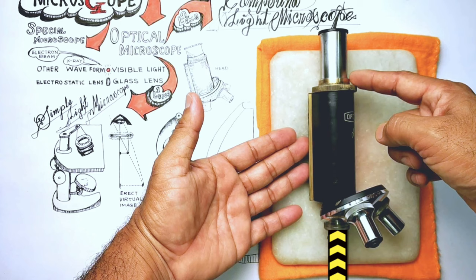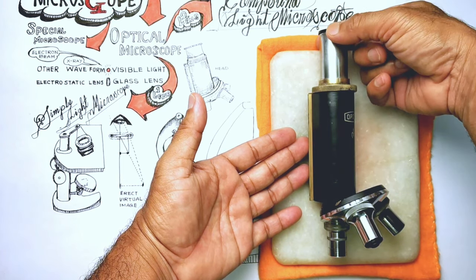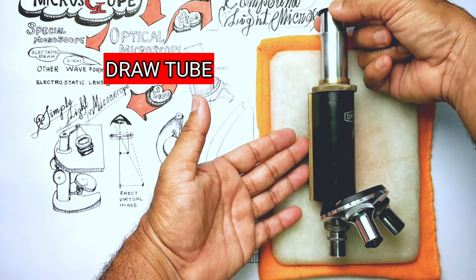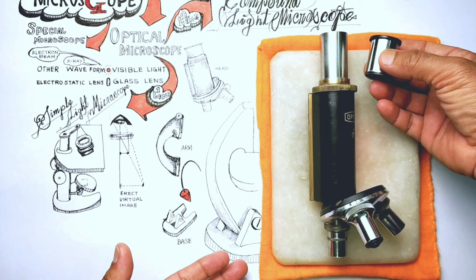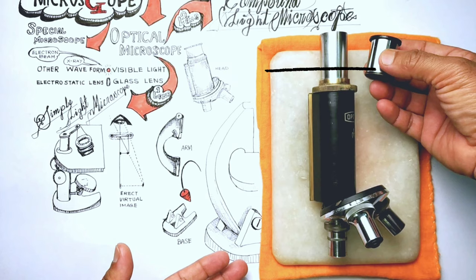It connects both the lenses and the light travels through it from the end of objective lens to ocular lens. The narrower end of the body tube holds a small tube known as the draw tube. The draw tube contains one of the two lenses of the compound microscope and it is known as the eyepiece lens or the ocular lens.